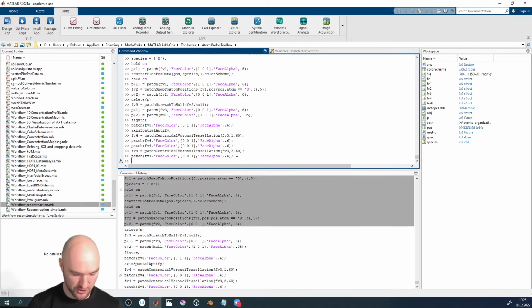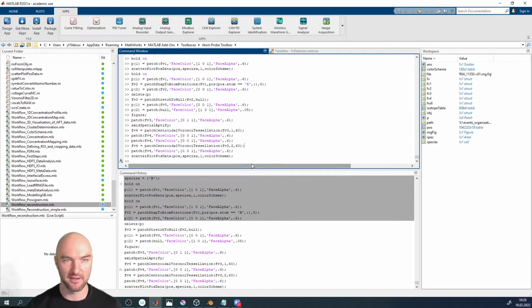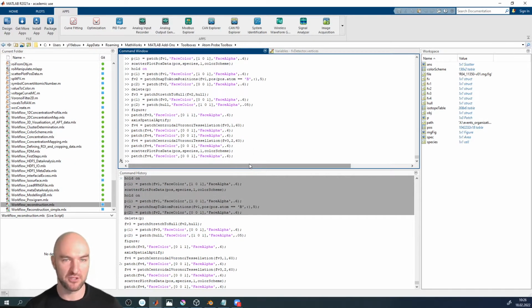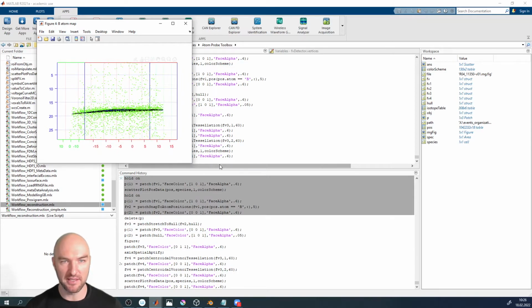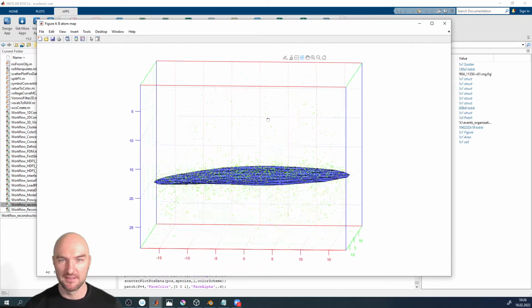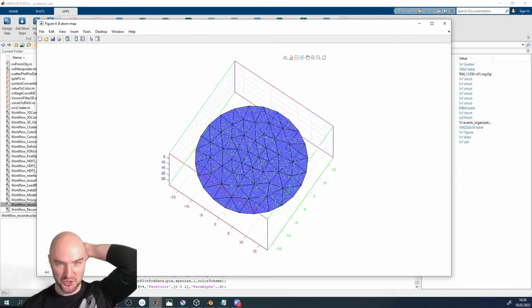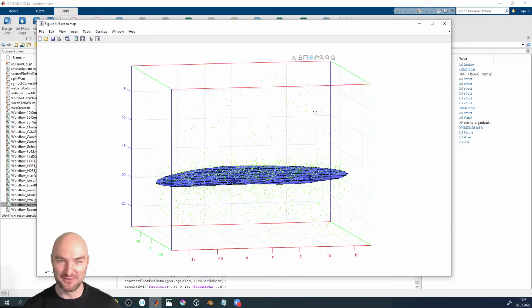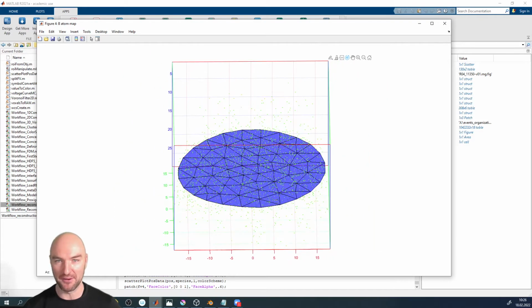But let's just go and plot our boron atoms again, and plot our patch object on top of that. And now you can see we've got a fairly nice grain boundary model. Okay, and now we took an hour and a half to model a grain boundary, but I can assure you, if you've got any amount of experience doing that, it will usually take you like 5 minutes to model a grain boundary, especially one like that.